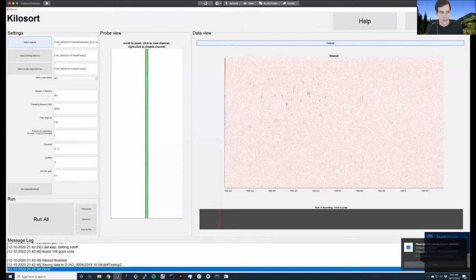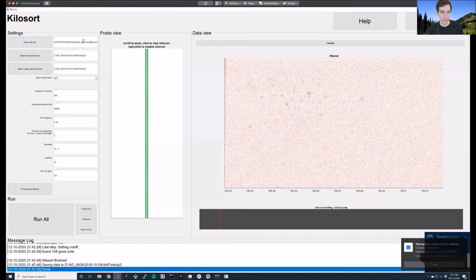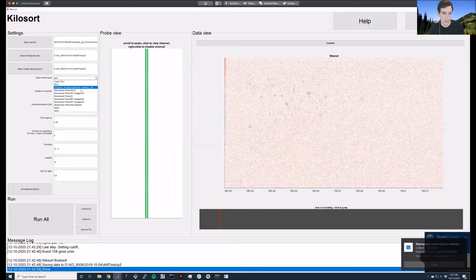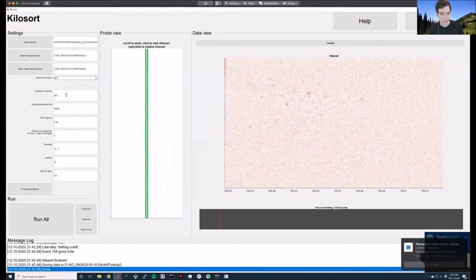The first thing you do is select the data file to load — it pulls up a file browser and you pick a data file. It automatically sets the working directory and results output directory, but you can pick different ones. Then you pick a channel map; for instance phase 3b1 will be your normal Neuropixels 1.0 probe. After that it should automatically fill in the rest of the parameters and load up to show you some data.